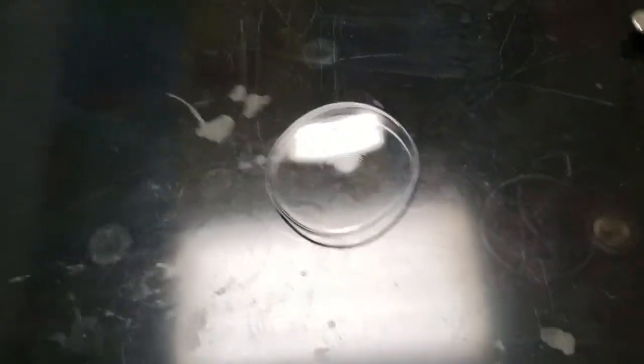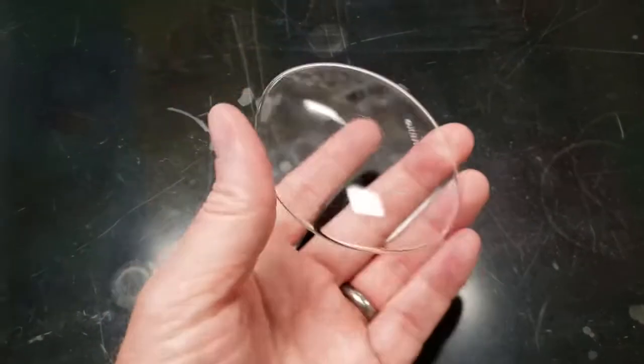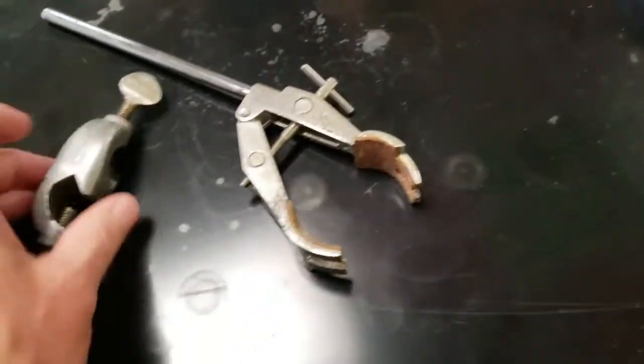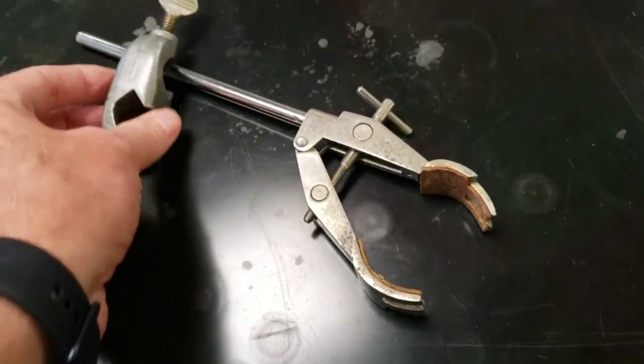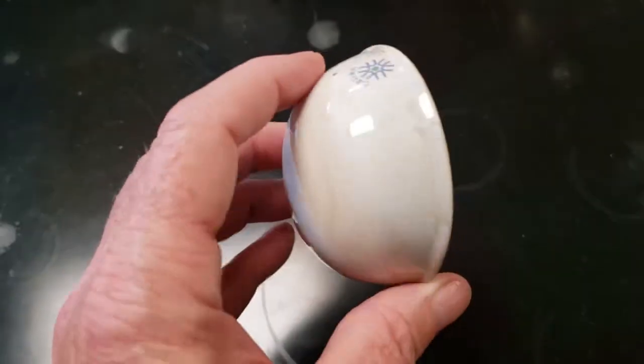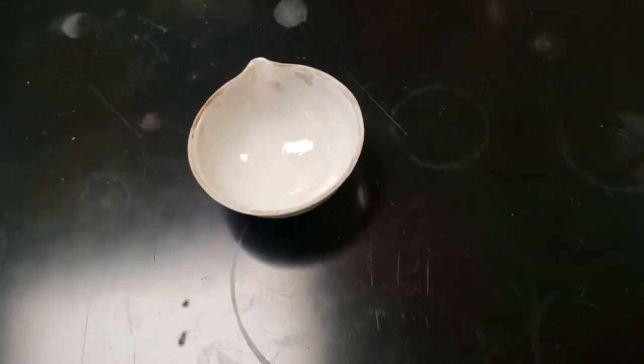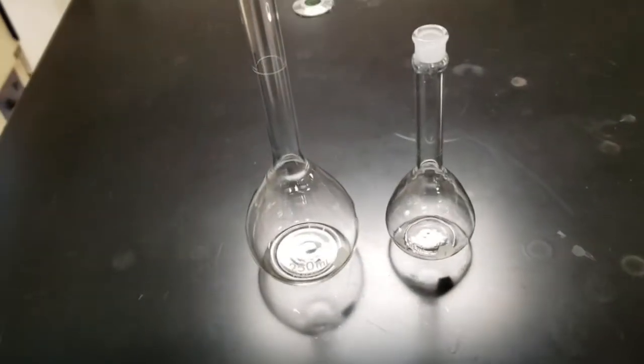This is a watch glass. It looks like a huge contact lens. You can put it on top of an evaporating dish or something like that, and you don't have to worry about stuff spewing out. This is a utility clamp. It is just that, it has multiple uses. Here's an evaporating dish that is a ceramic one. Also, it can heat to very high temperatures. Also, very breakable.